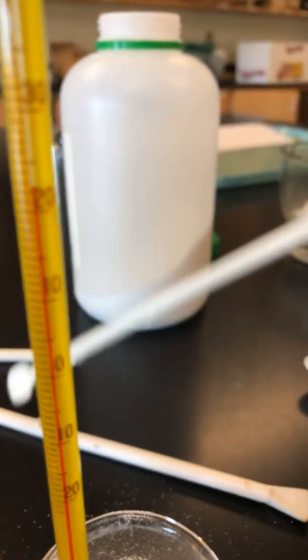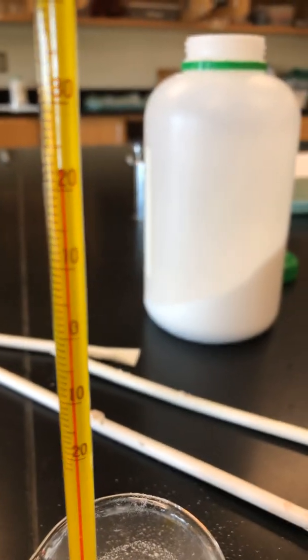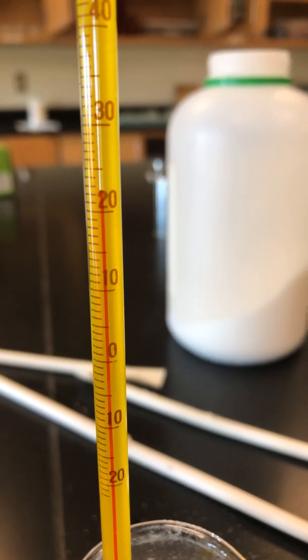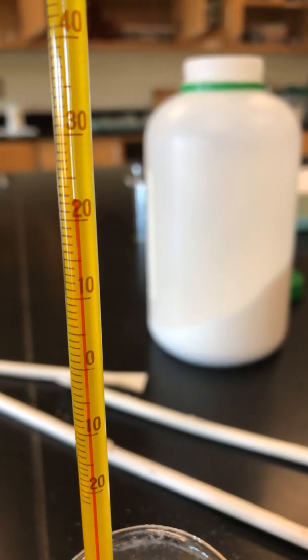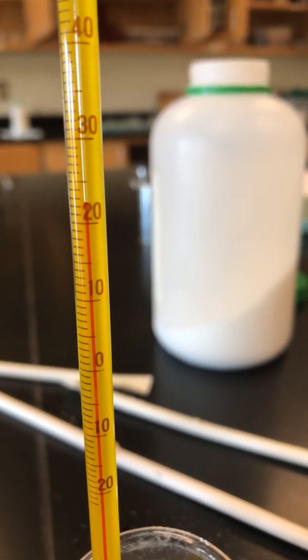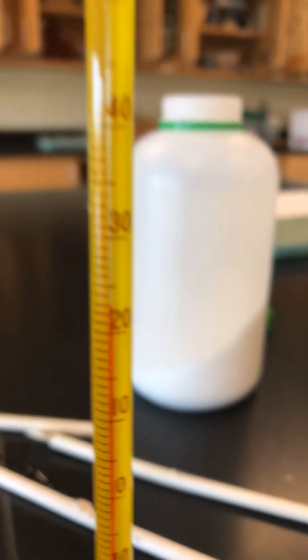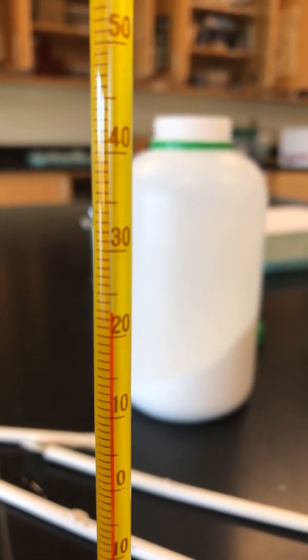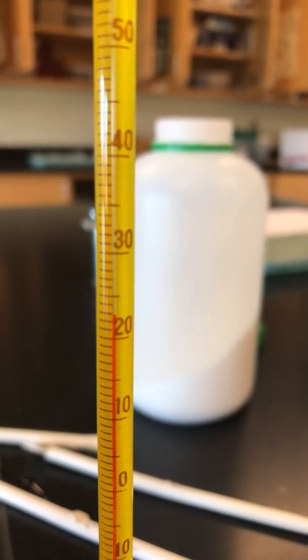I'm going to stop stirring here for a moment. And when that red alcohol in the thermometer stops changing, stops moving up or down, then we record the final temperature of the mixture. So let me see if I can get a... So there you go. Record your final temperature for solution or sample C.